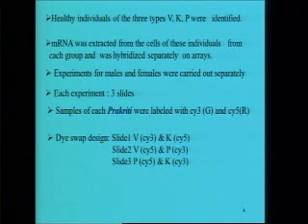On slide 1, for vata prakriti sample, the reporter molecule added was Cy3. For kapha prakriti, it was Cy5. On slide 2, for vata prakriti, a different reporter molecule was used. On slide 1 it is Cy3, for slide 2 it is Cy5. And for pitta prakriti, it is Cy3. On the next slide, for pitta prakriti, the reporter molecule used was Cy5, and for kapha prakriti it was Cy3. Okay, so we have two observations on vata prakriti individuals with different reporter molecules. Same thing for kapha and same thing for pitta.